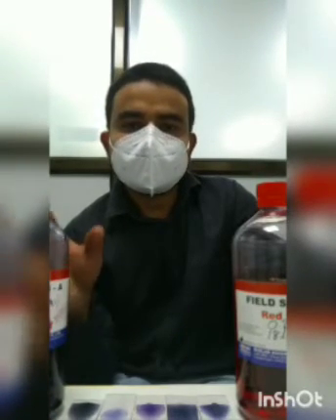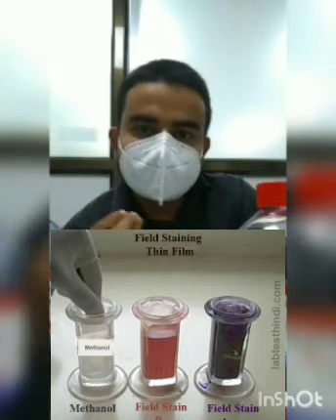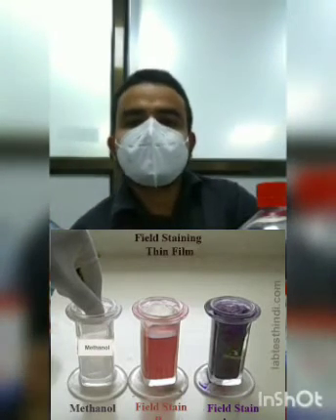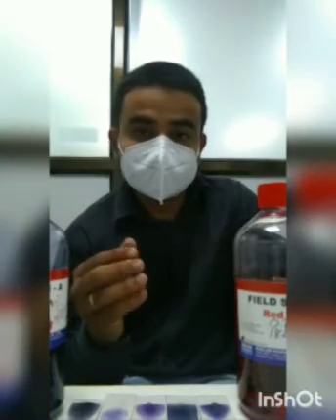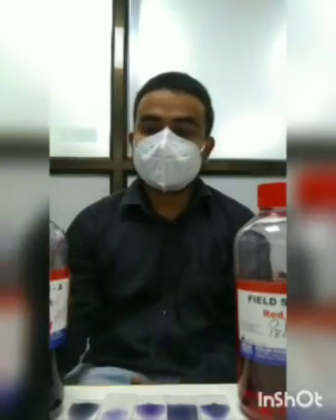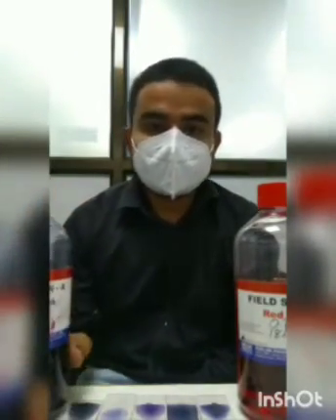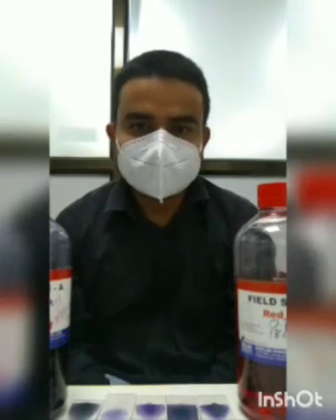So methylene blue is a basic substance. It will bind to the acidic component of the cell. The acidic components of cells are the nucleic acids, the DNA and the RNA. They basically form the nucleus. So this particular stain will stain the nuclear component of the cells.